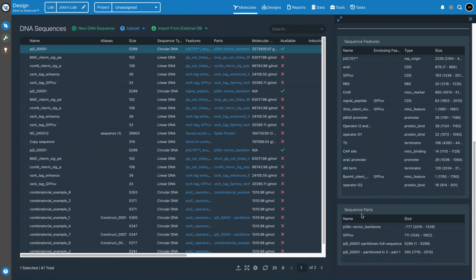These are usually created directly from features, but you can also create them independently. So you can have your annotations and from those annotations create parts, or you can just have parts and manage them separately. That will depend on how you prefer to work.